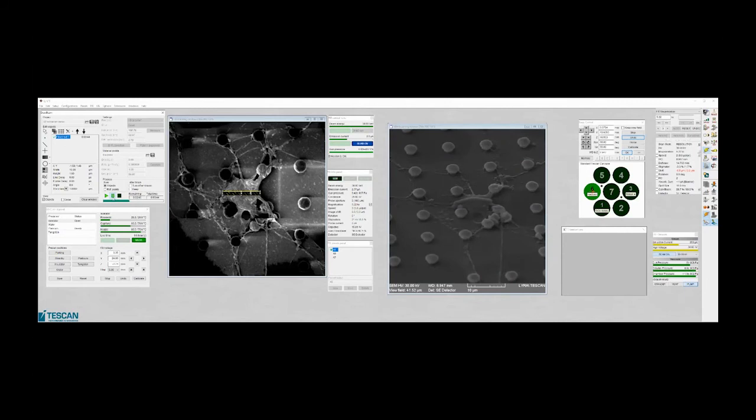To study the very surface of samples, we are not using only this ion beam induced deposition, but also electron beam induced deposition. I will not show it to you today because it's time consuming. To create a protective layer by electron beam will take about 10 minutes. Sometimes even 10 minutes is not sufficient and we have to run it twice.